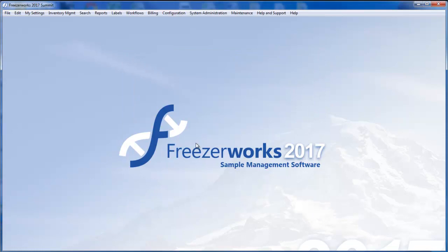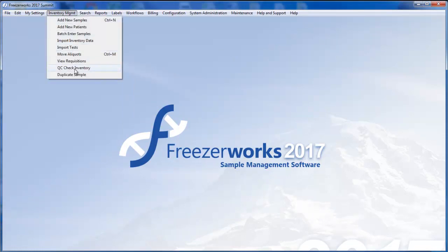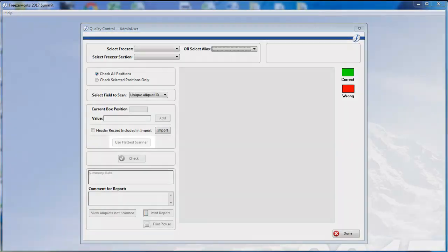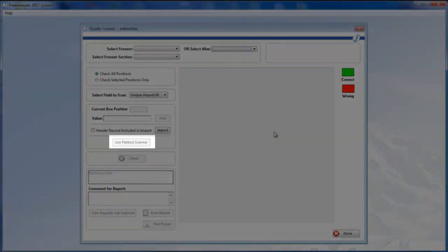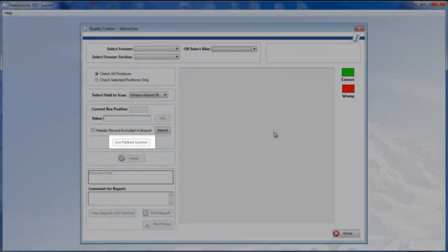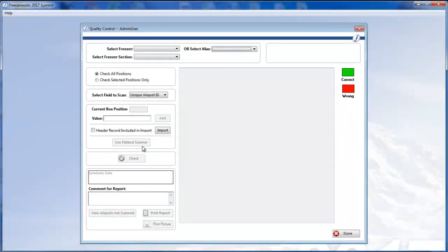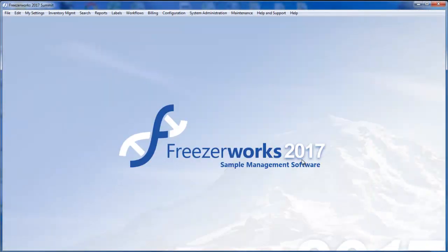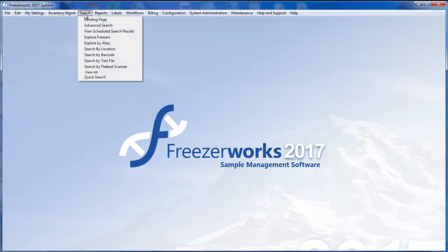For QC checks, you'll find that a flatbed scanner button has been added to the form. Finally, the new flatbed scanner search tool is in the Search menu, Search by Flatbed Scanner.